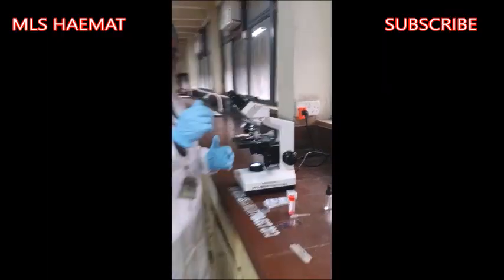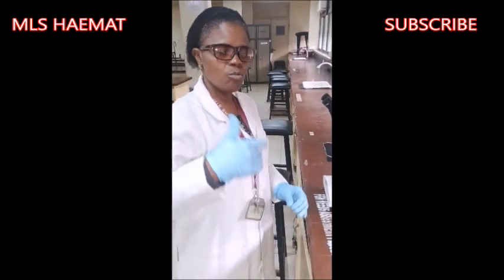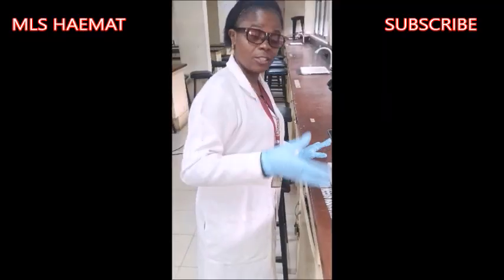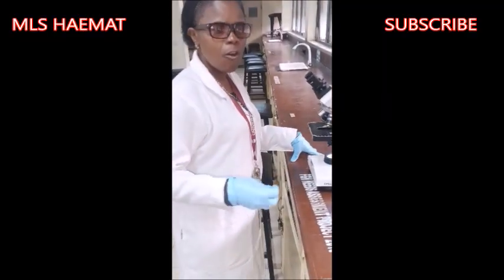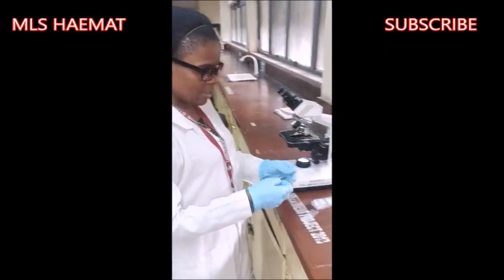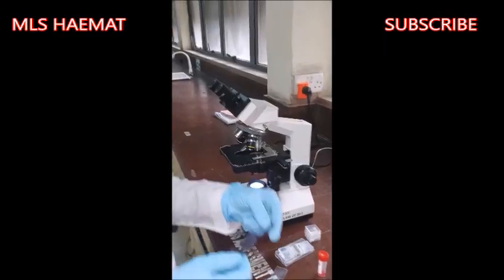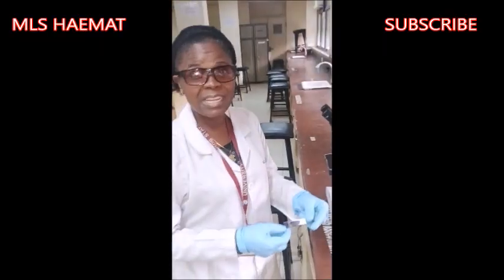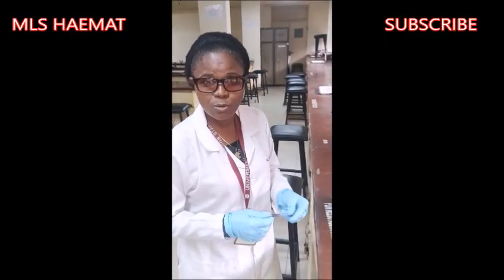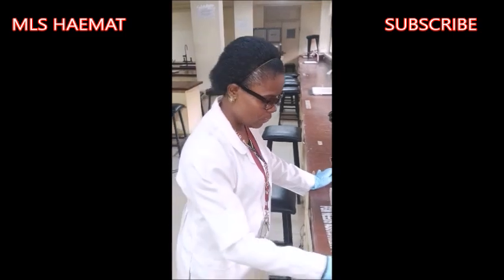Now, for you to use the microscope, you can either be required to view a wet preparation, that's a sample that is wet, or a sample that has been stained. And what do I mean by that? You can see I have a sample here. This is a blood sample. I've already made a thin film and I have stained it with Leishman stain. If I want to view this under the microscope, I must know the objective lens to use.